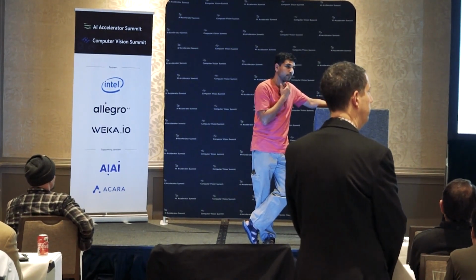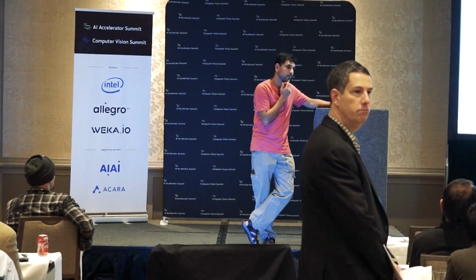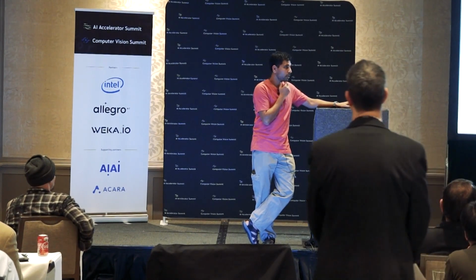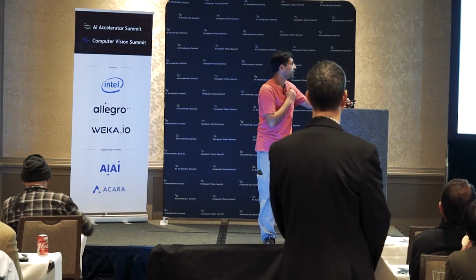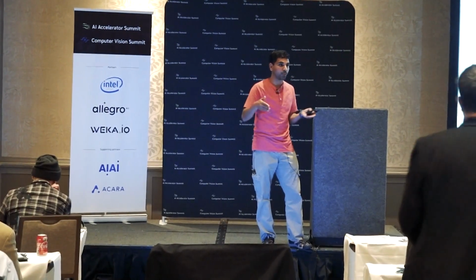Okay, but just one more question around that. Won't the scientists be wasting a lot of time in terms of identifying the good images from the bad images before they actually do the processing on that? So it's beyond that. When we are imaging these cells, we are actually imaging populations. In a particular field of view, depending on how much microscope zoom you have, you get 100 to 1,000 cells in a particular view, right? And then you want to go and see what every cell in that field of view is doing. So essentially the statistics we are deriving are from the population.